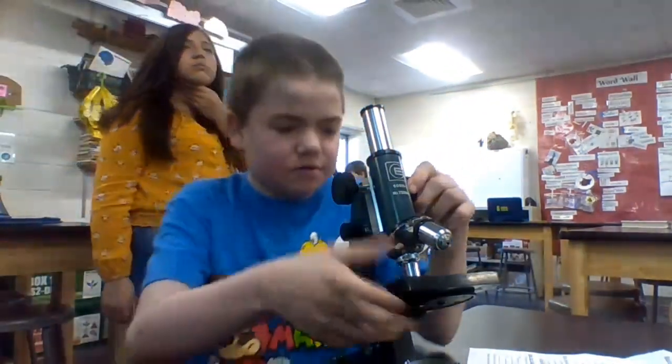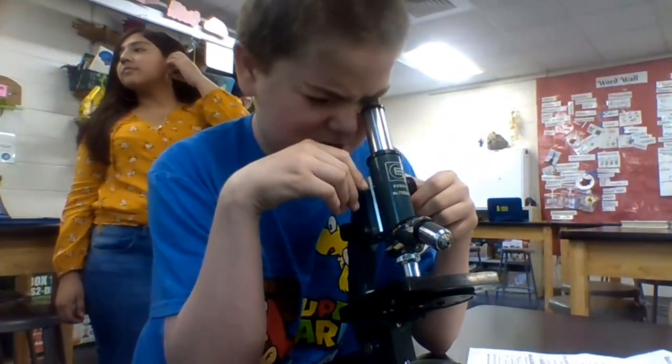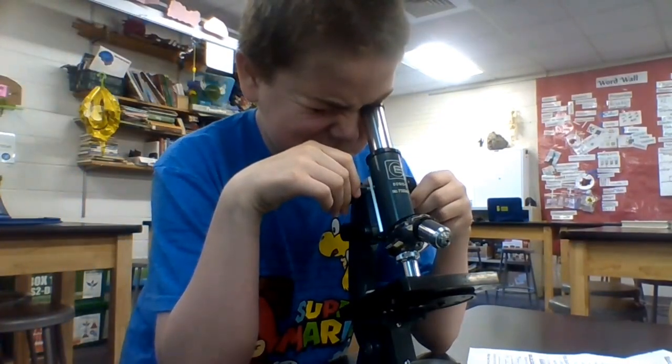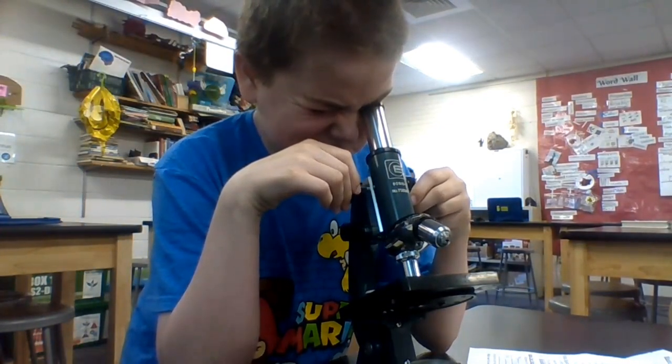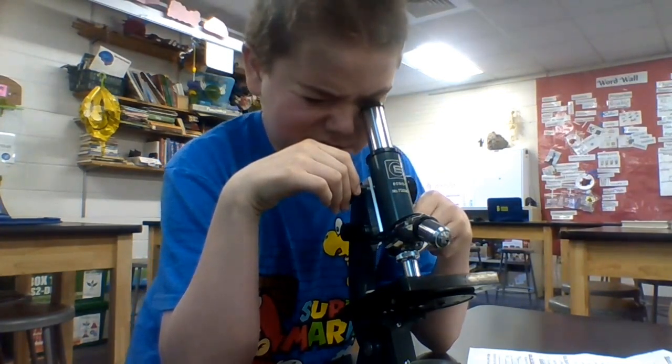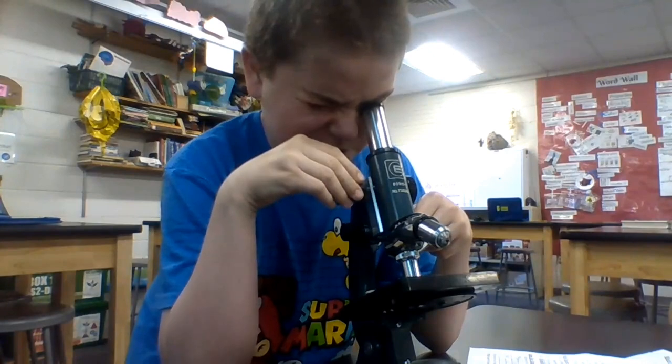And you have to put your eye in the eyepiece and turn up slowly until you see something. And then you can use your fine adjustment to focus the details in.